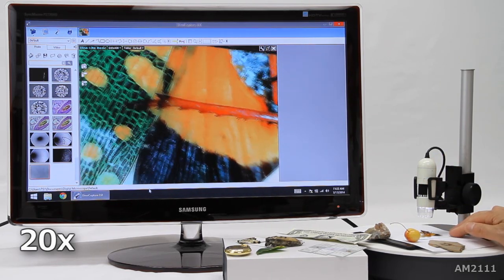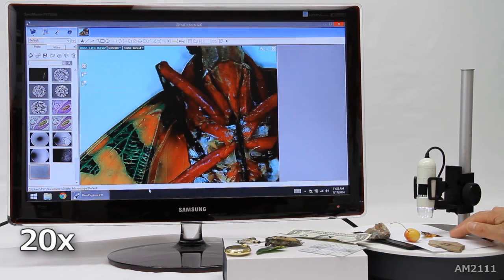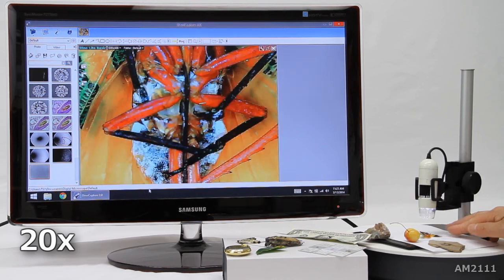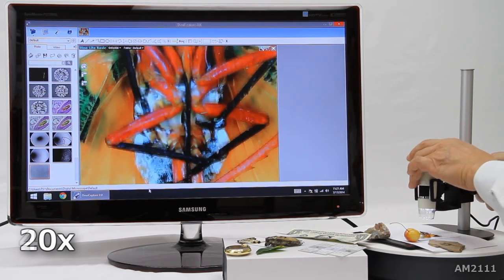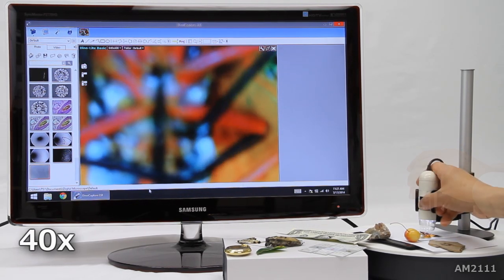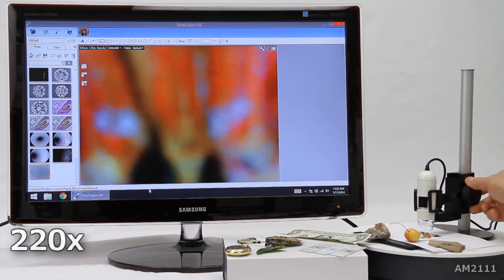The AM2111 connects directly to a computer and uses included software for live view imaging, capturing images, video and more.